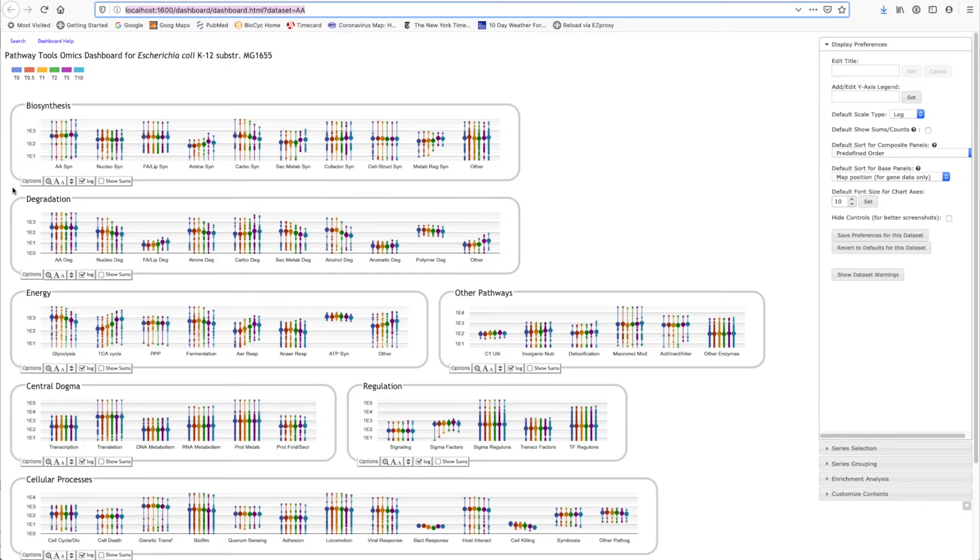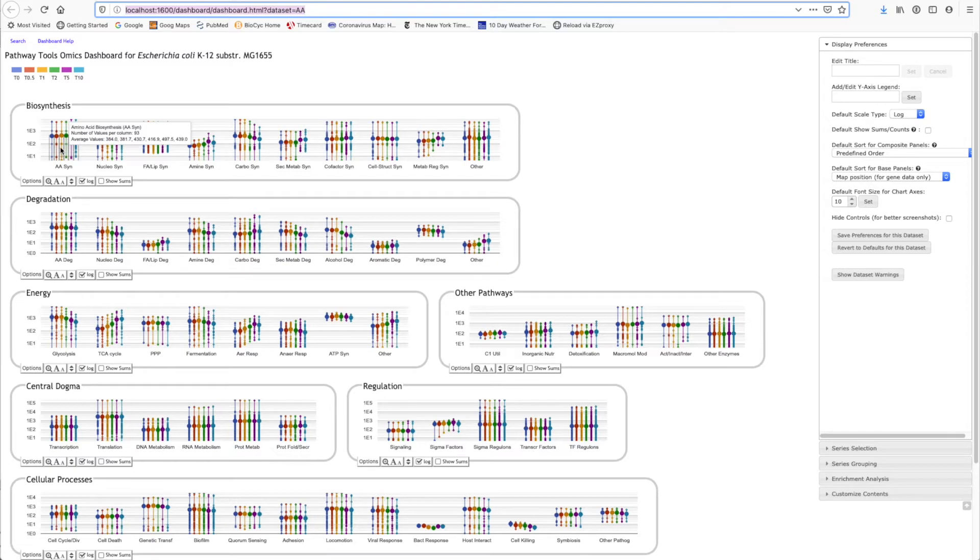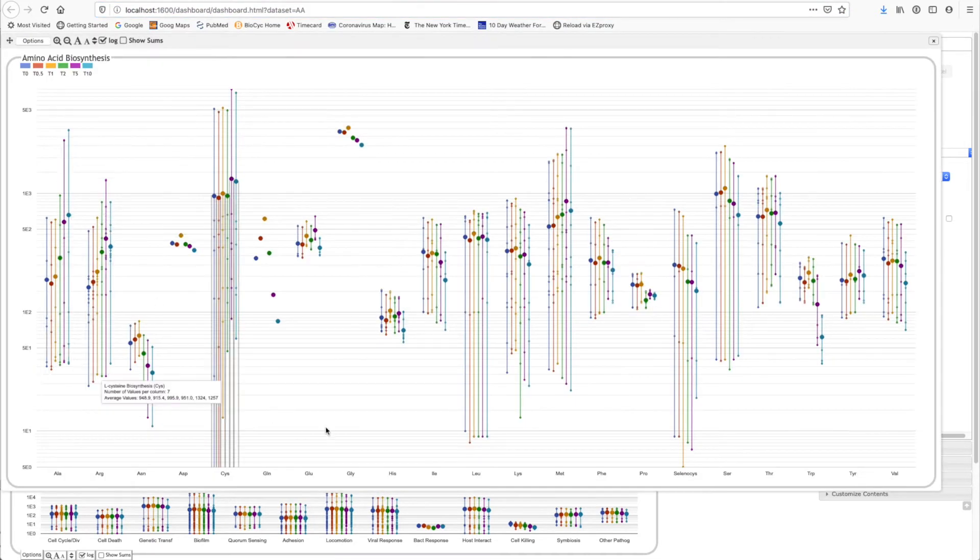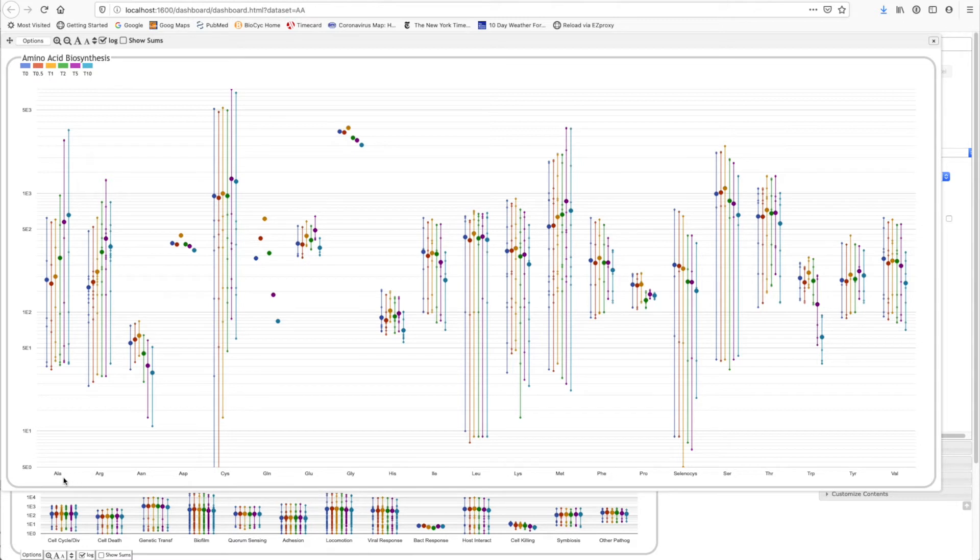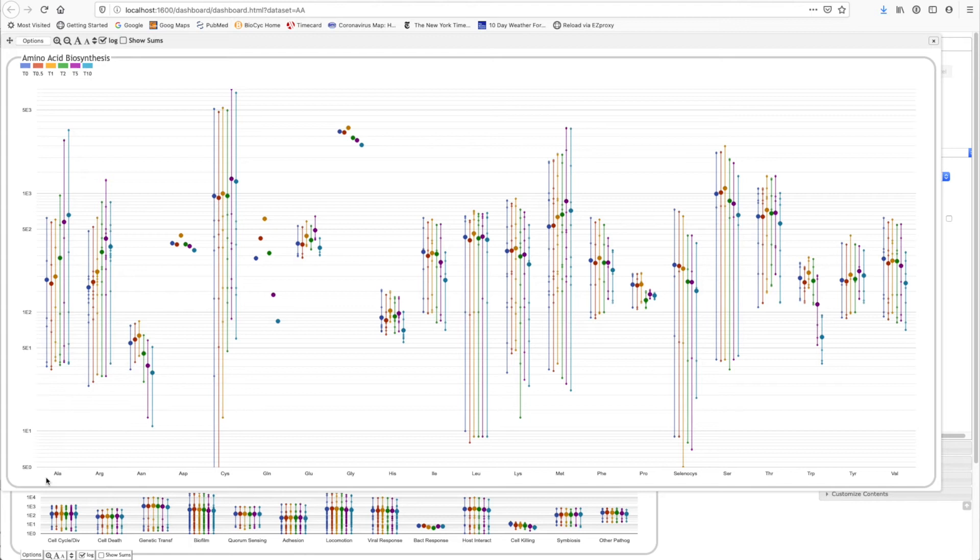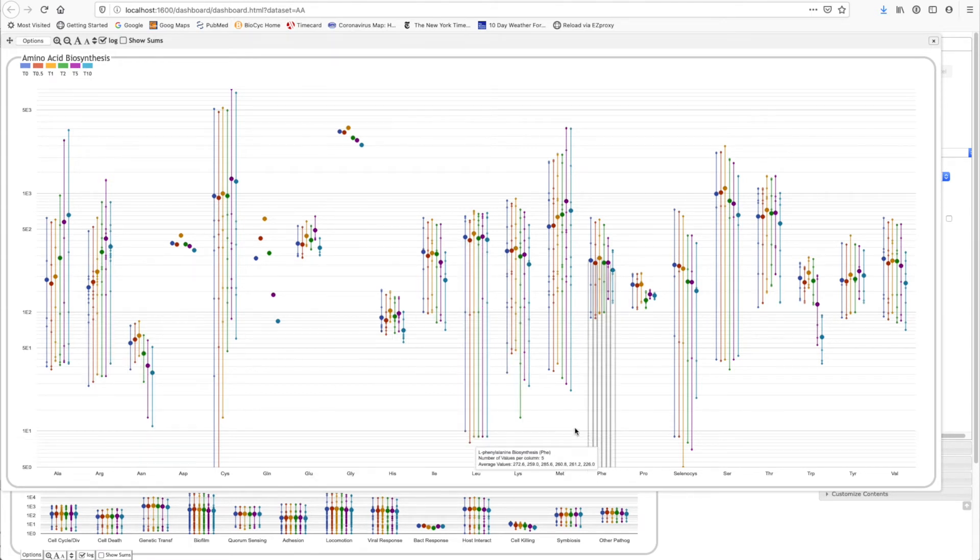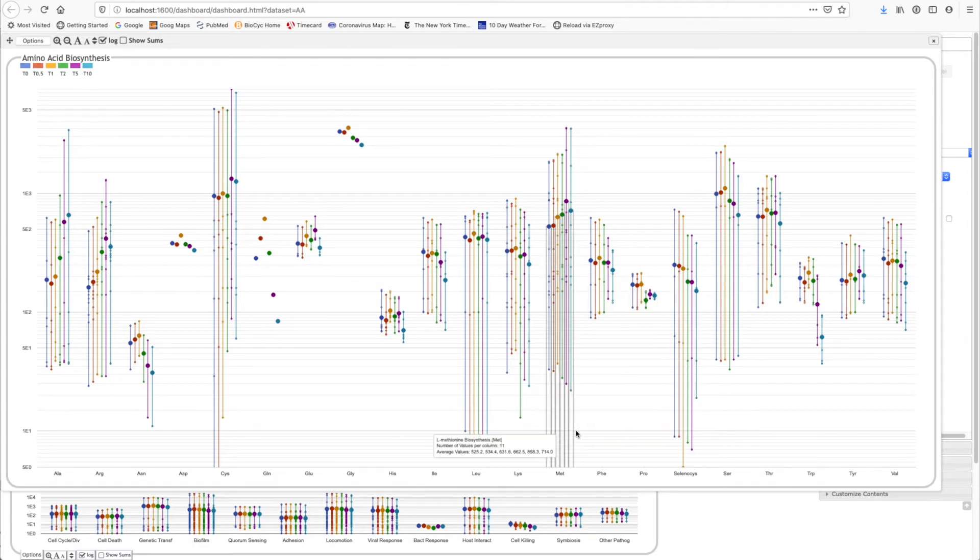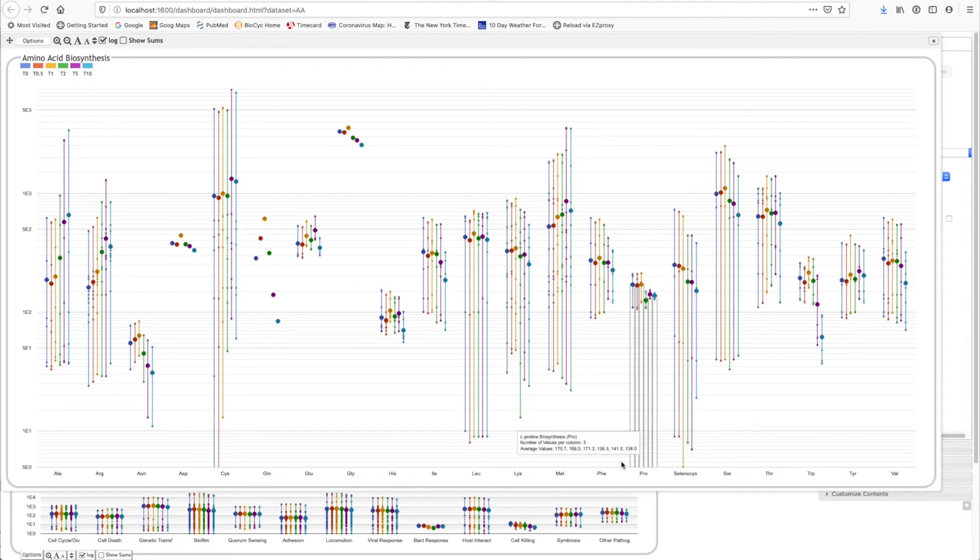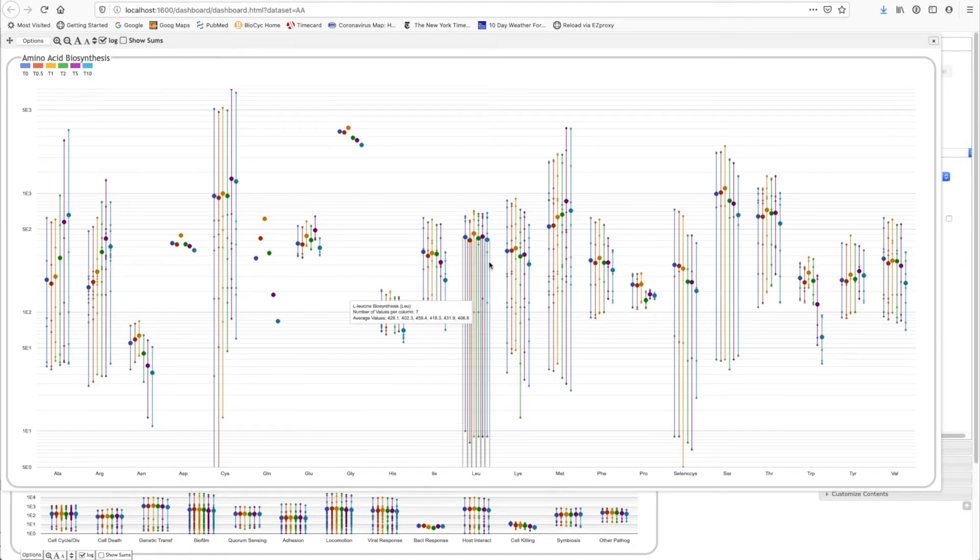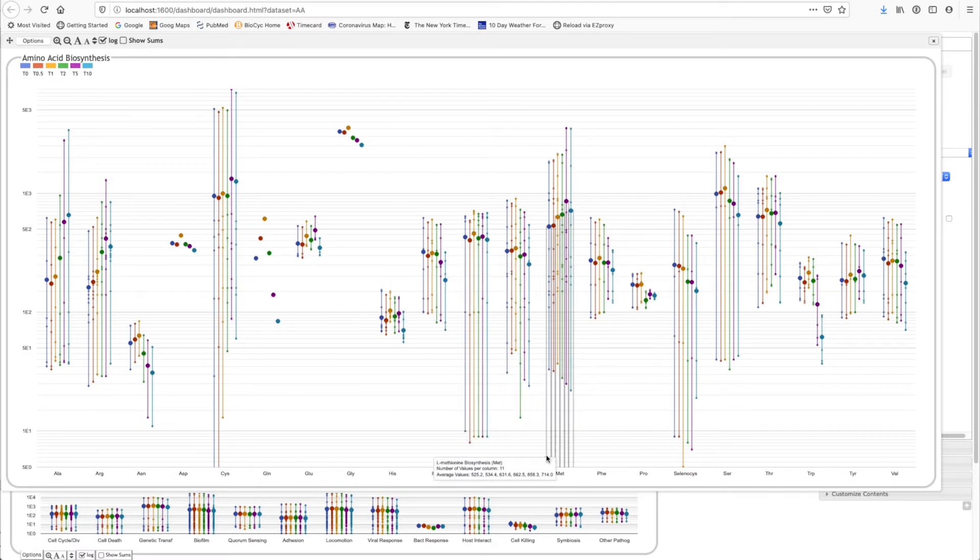If we want to see more details about the response of any particular system, we can click on it. And then we get a similar plot for, in this case, every amino acid biosynthetic pathway. So we can see that alanine biosynthesis is going up, as is arginine biosynthesis, as is methionine biosynthesis. And once again, we're using exactly the same format, where individual genes are plotted along each vertical bar for each time point, and the fat dots are the averages.